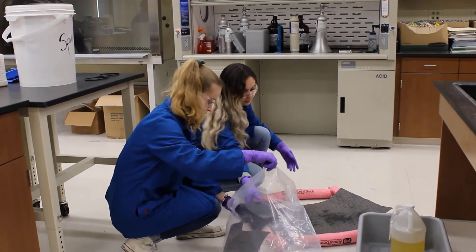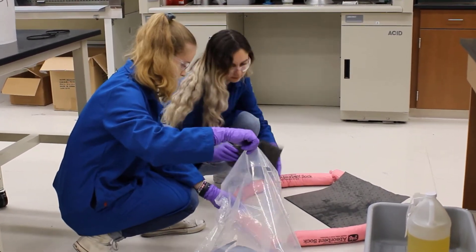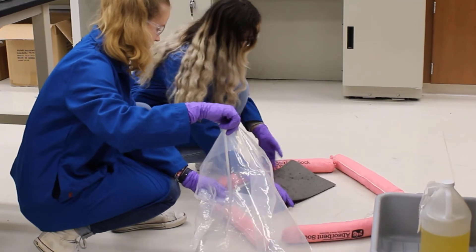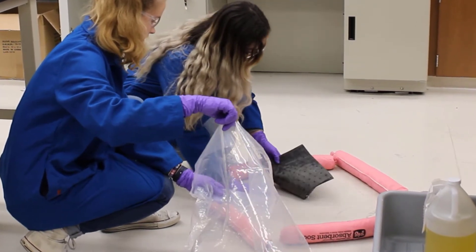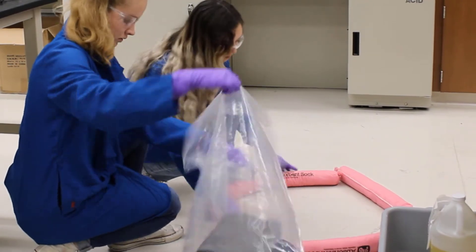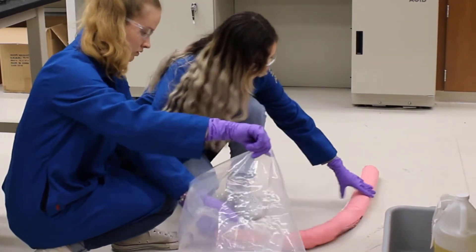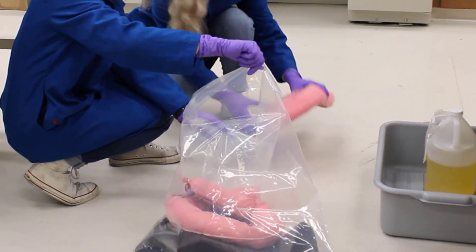Next, put all the materials you used into the bag. Take your time to avoid splashing or dripping materials outside of the contained area. Be sure to include everything: fold spill pads, sweep up any neutralizing powder you used with the dustpan and broom, pack up the spill socks, and use tongs to remove any broken glass or material.